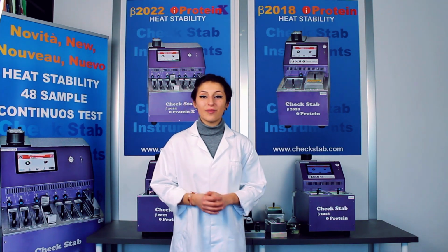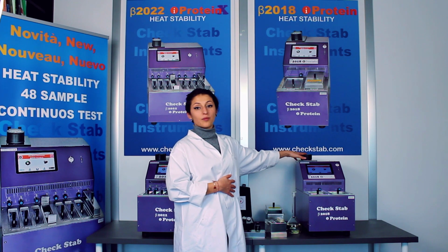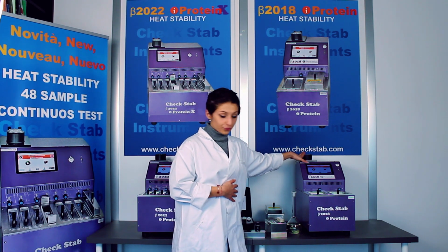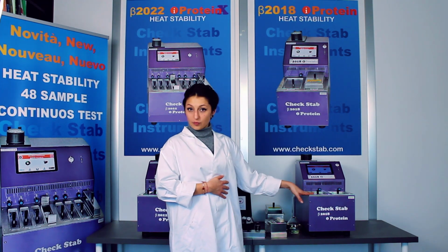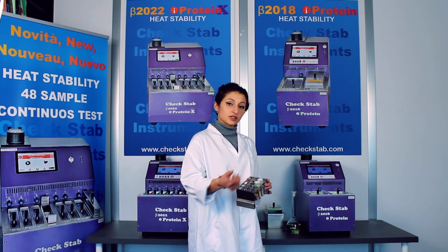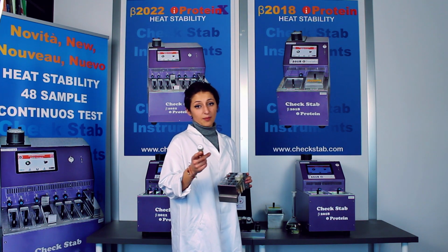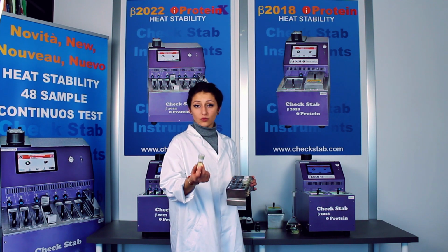So let's know more about Beta 2018 iProtein. Here we have the high precision nephelometer with a resolution from 0.5 to 800 NTU, a hot thermostatic bath, a cold thermostatic bath. We can analyze up to 15 samples at the same time, and thanks to the Smart Cup test tube technology, it's possible to rename the sample directly through the software during the reading of the T1.